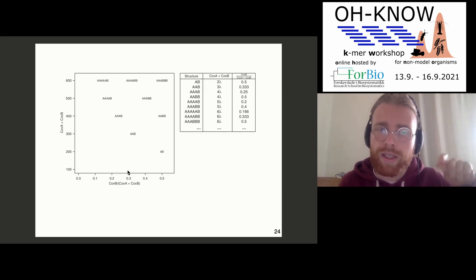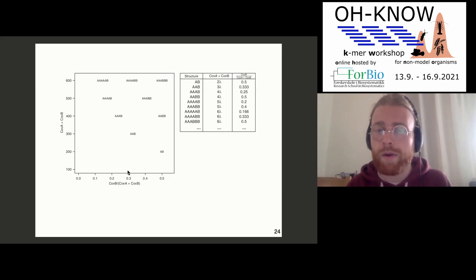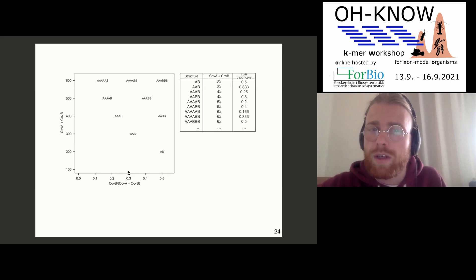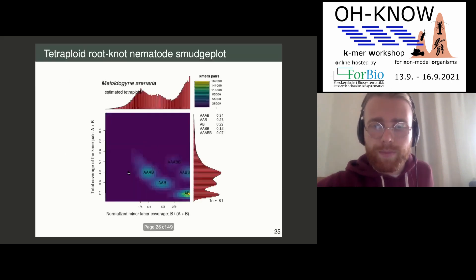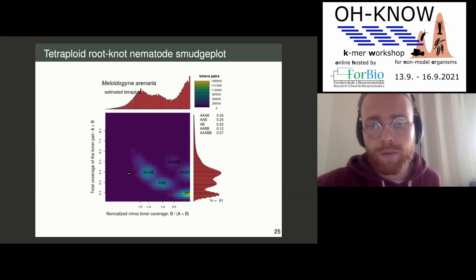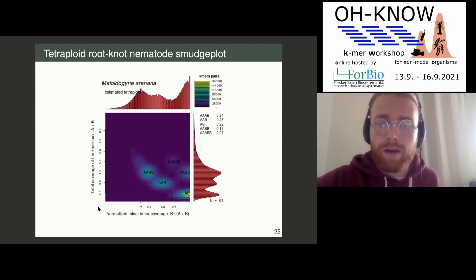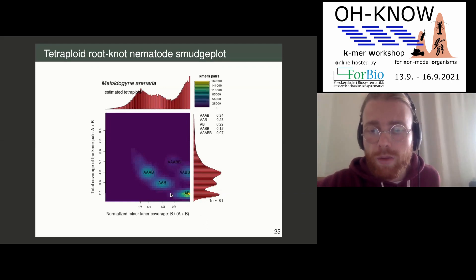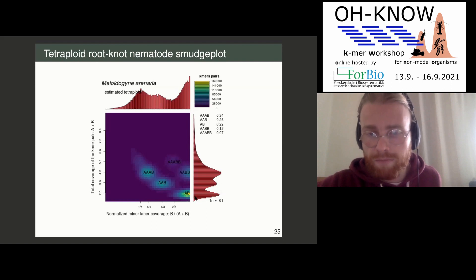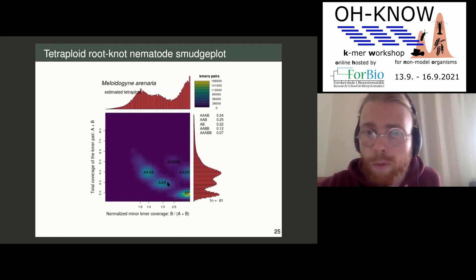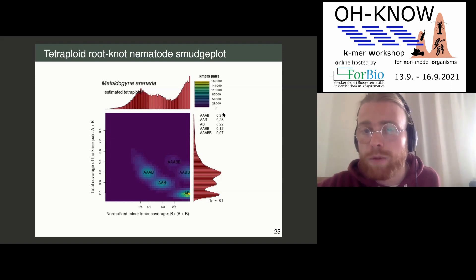The only problem is that we selected the k-mer pairs in a non-random fashion, so this gives a relative genomic structure, not absolute. This is how it looks — this is the smudge plot. On the X axis we have the coverage ratio, and on the Y axis the total coverage. We see a lot of AB types of loci, a lot of AAB types of loci, and most of all AABB types of loci.